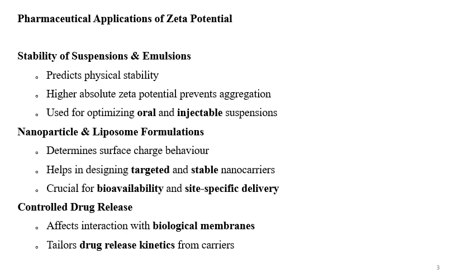If aggregation is there, it will affect the formulation stability, dosing, and other physical and therapeutic properties. It is used for optimizing oral and injectable suspensions. So, the zeta potential is required to be measured and maintained. Nanoparticle liposome formulations. In this, zeta potential determines surface charge behavior, helps in designing the targeted and stable nanocarriers. It is crucial for bioavailability and site-specific delivery. Controlled release formulations. Zeta potential affects interaction with biological membranes and tailors drug release kinetics from the carriers.